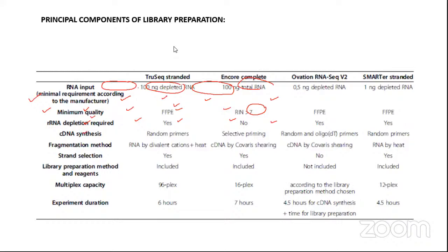Fragmentation. Once we have RNA, at the first step we don't fragment it, because RNA is very unstable and will already be a little fragmented. Even after converting the FFPE sample to cDNA, we don't fragment, because we already know it is fragmented.